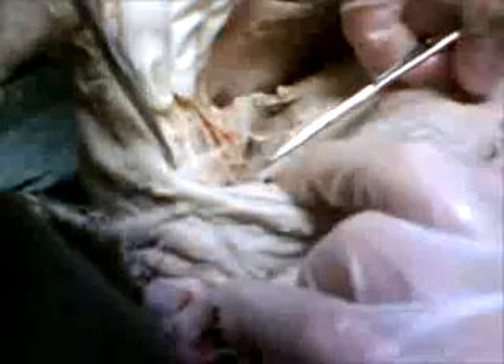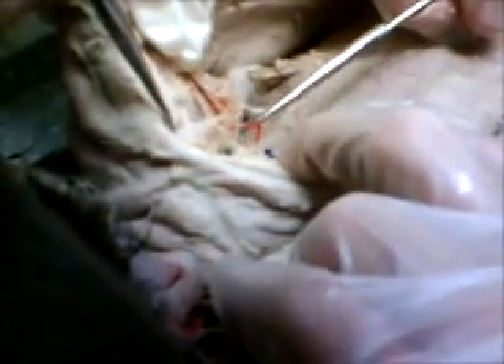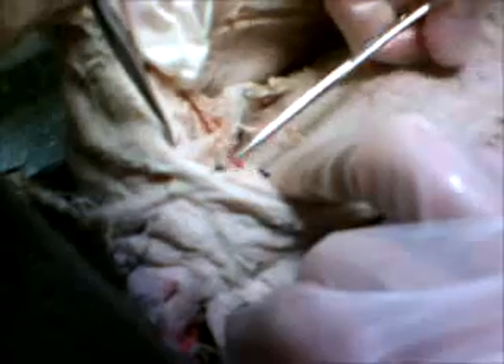If you look at this muscle right here — we're recording this for documentation. You cut the red vein. Oh wait, it's not cutting.